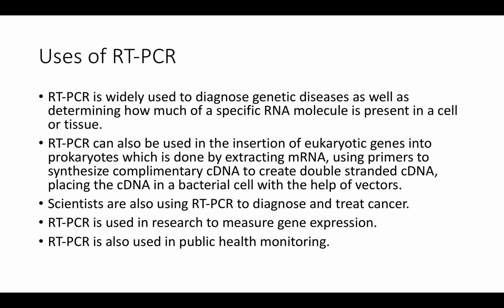This is done by taking the eukaryotic cell that contains the gene of interest and extracting the fully modified mRNA molecule. The mRNA is then exposed to reverse transcriptase, which produces the DNA molecule that is complementary to that mRNA molecule. The DNA-RNA complex is then separated under basic conditions.